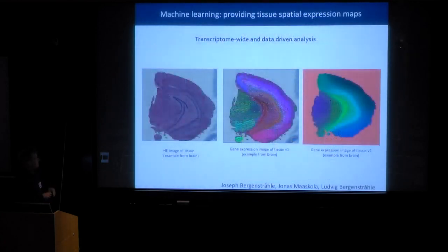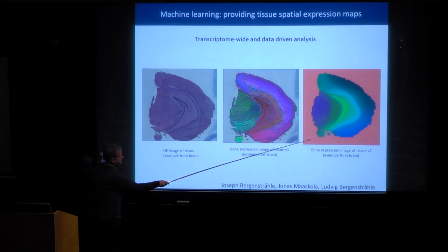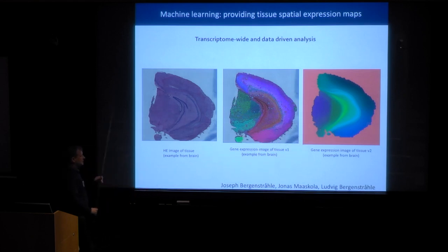And this is just a demonstration of part of the brain. This is the most recent arrays from 10x, which you can see are much denser. And by computational means now, spinning out from the bioRxiv of the probabilistic methods that we're using, the data looks something like this today, which is looking very nice, I would say.